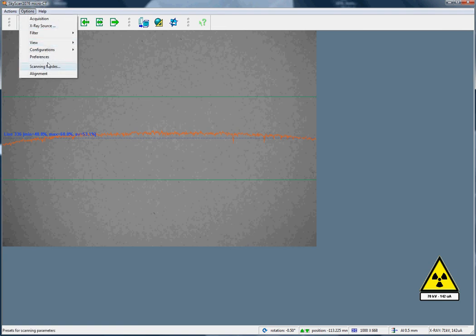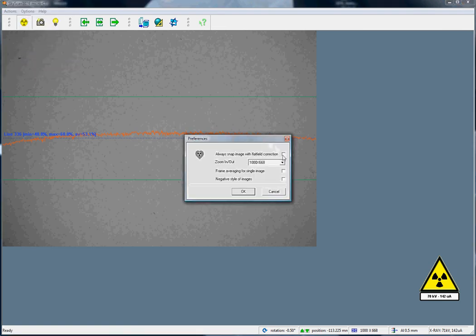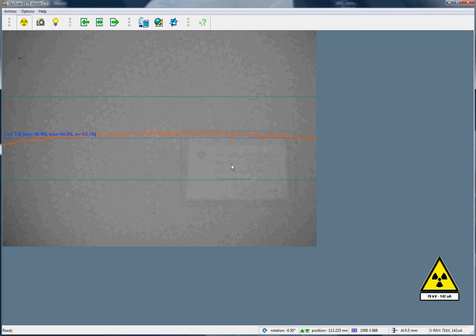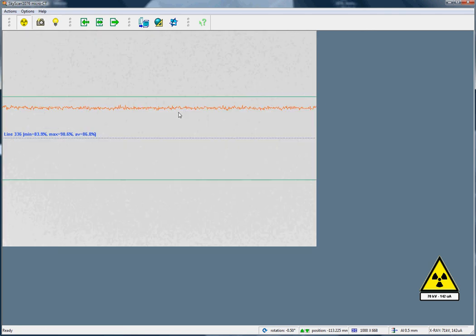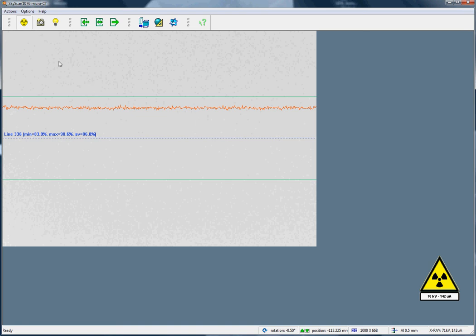If I go to the preferences and put on the flat field correction again, I can take an image that looks as if it's correct, but in fact, this flat field correction was taken with a previous voltage of 90 kilovolts, and so it's not correct. Now, we need to take a new flat field correction. This is extremely easy to do.